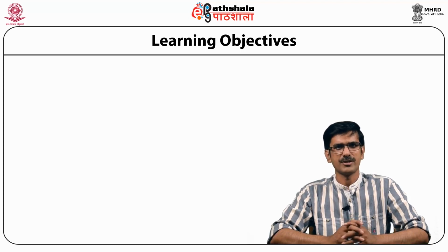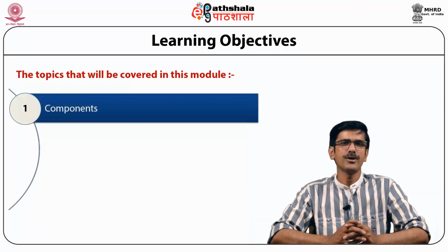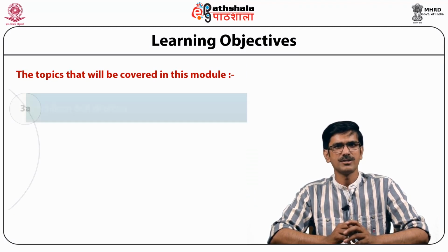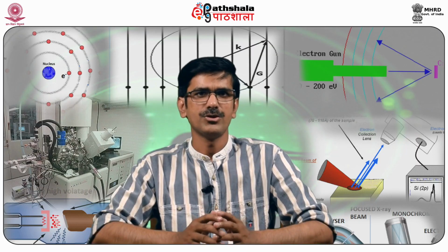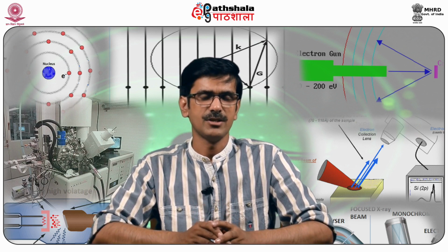So here we'll start. The topics that we are going to cover in this module are the components of the EDAX system, the excitation source, the X-ray detector, the silicon drift detector, the pulse processor and the computer display. So the first is the components of EDAX.